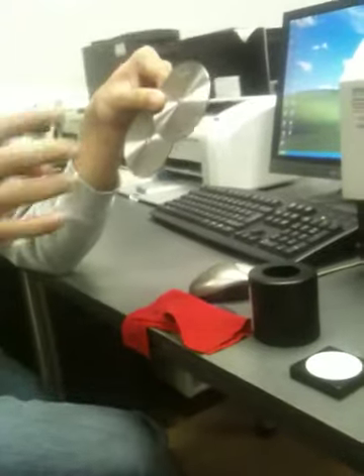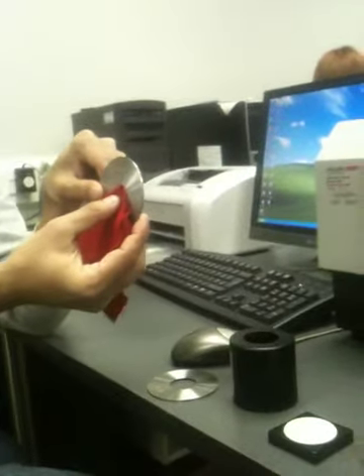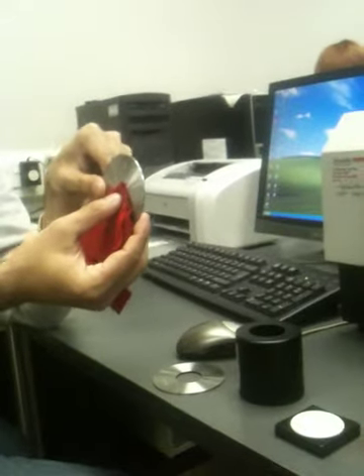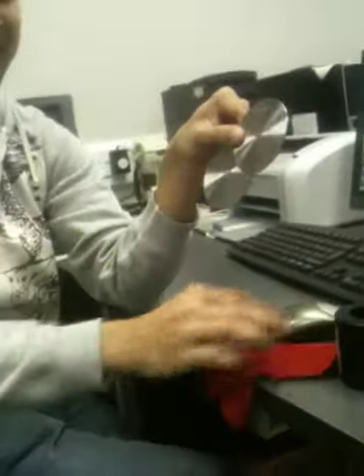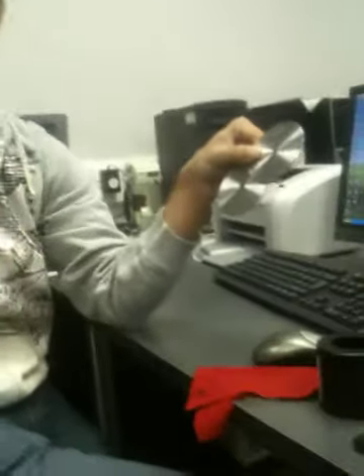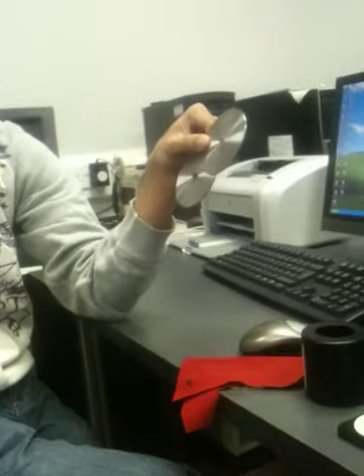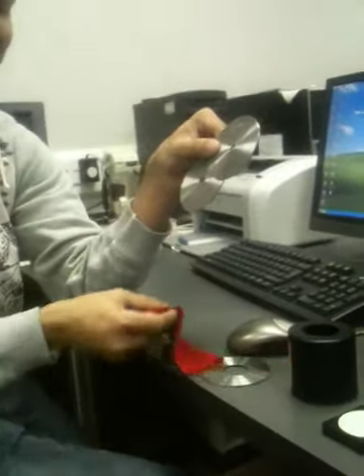Not seeing more, because it will all be averaged. But with the small one, you might pick a very extreme color which might not be the total picture of the fabric. Whereas the bigger area could give you a better result. But sometimes you have very small samples and you can't go bigger. So it depends. All right, now we'll be using the SAV.